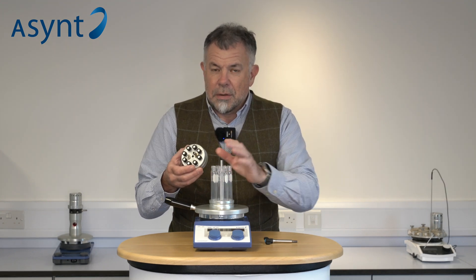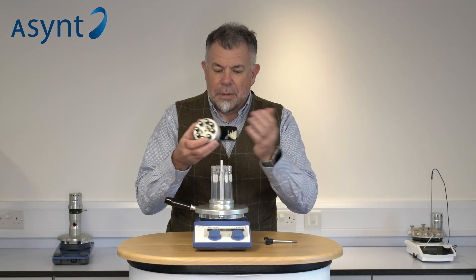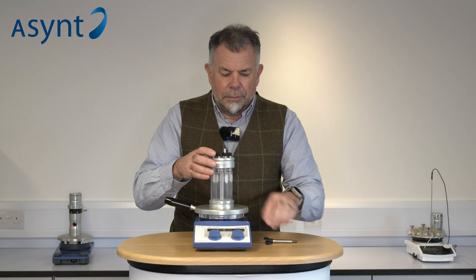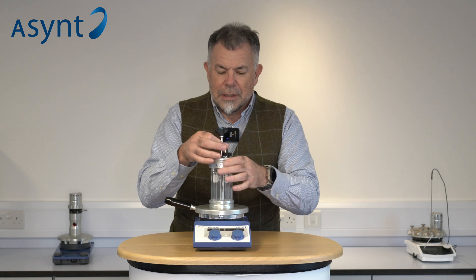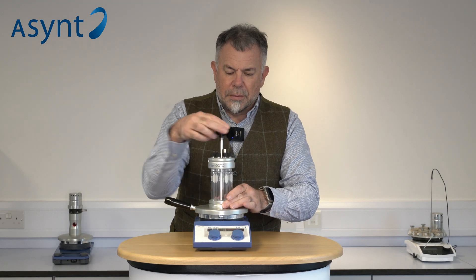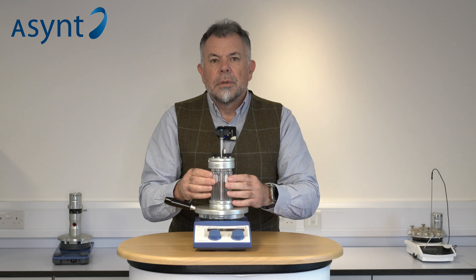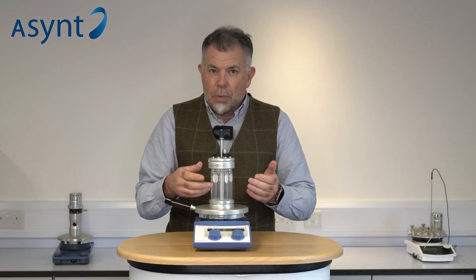We use standard low-cost tubes and standard low-cost septums. It's very easy to set up and get started. Magnetic stirring in eight positions on the standard hot plate stirrer, and with these longer tubes, refluxing by air cooling.